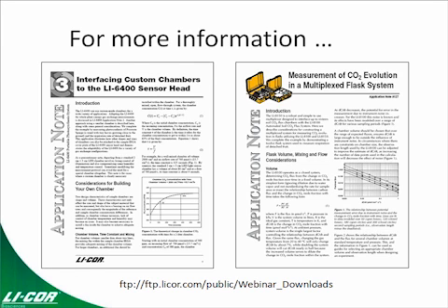Thanks for the question. It depends on what instrument you're actually going to be interfacing it with. There are a lot of considerations with the 6400, the 8100, or any of the analyzers. If you're using the 8100 and 6400, you do have some potential for utilizing the pumps and fans within those two instruments. If you're using some of the other analyzers, you will have to look at getting additional pumps and fans to interact with those two instruments. And then there's the actual physical mounting of the chambers onto the instruments.